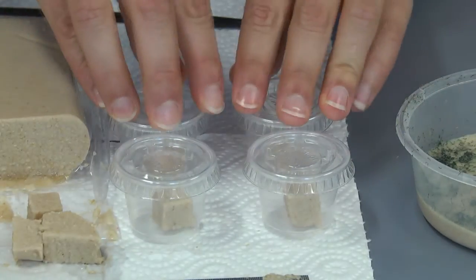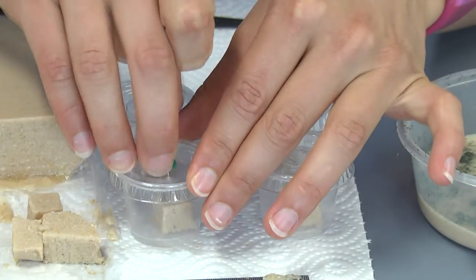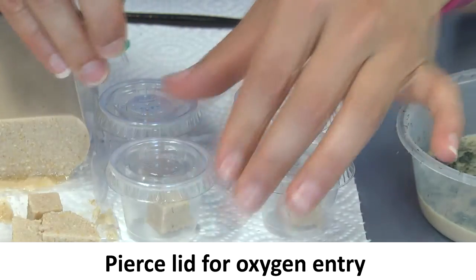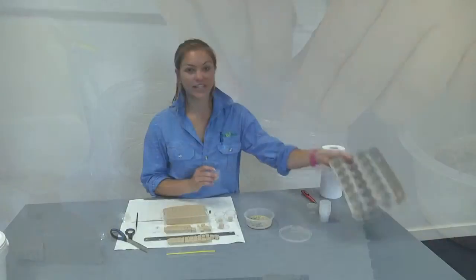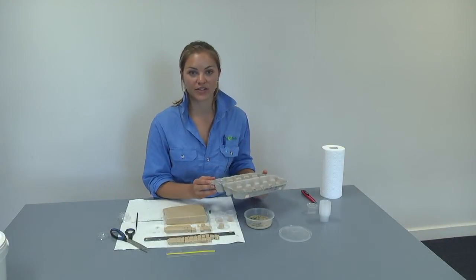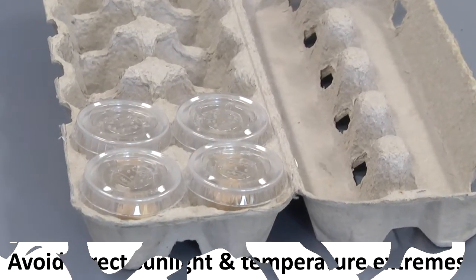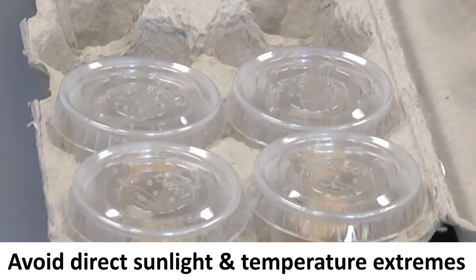Once each of your rearing cups has an egg or neonate in it, take your thumbtack, needle, or Stanley knife and pierce several holes in the lid of your cup so that your neonate will have oxygen as it grows. A useful way to store your cups is in an egg carton or a tray so you can move them around your classroom or take them home easily. Make sure you keep them out of direct sunlight and away from air conditioners or heaters to avoid temperature extremes.